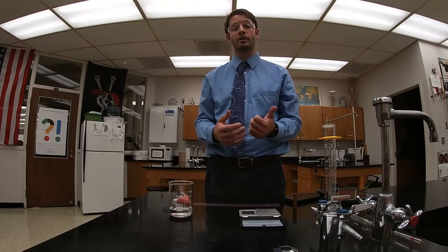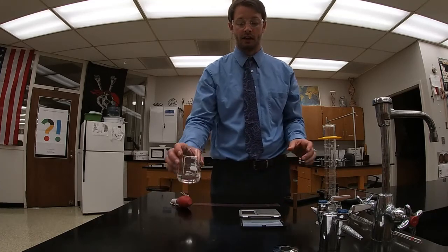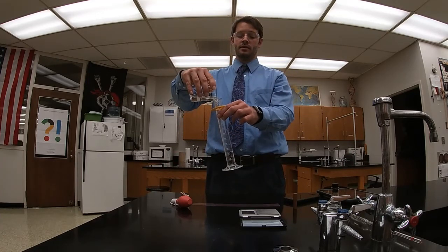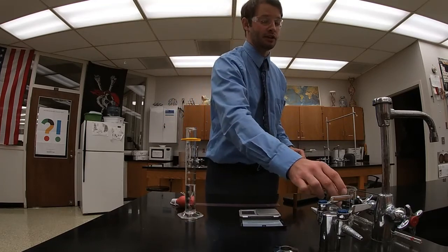I have the mass, but now I'm going to calculate the volume by water displacement. To do this, I need enough water to submerge my cylinder. So I'm going to pour some of my remaining distilled water in my graduated cylinder, and that is my starting volume.